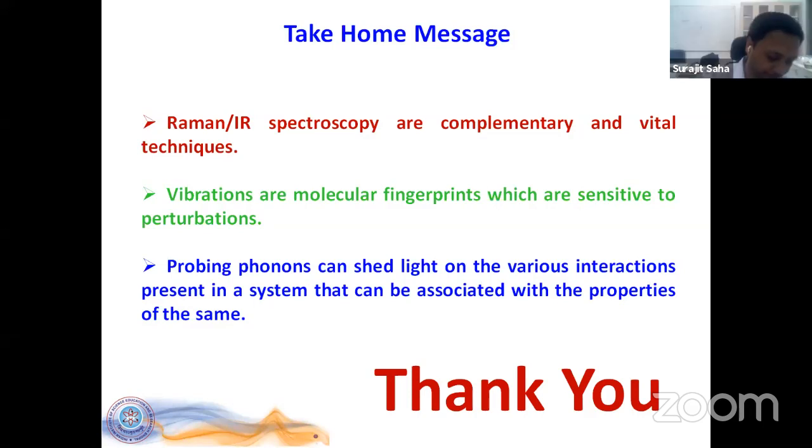Okay. So now if you're talking about N or P type of doping, one has to really analyze the details of the spectrum. See, when we're talking about N or P, that means I'm talking about charges, electrons or holes. So the moment I have electrons, there is a certain condition that is set in. When I'm talking about holes, there is a certain condition that is set in.